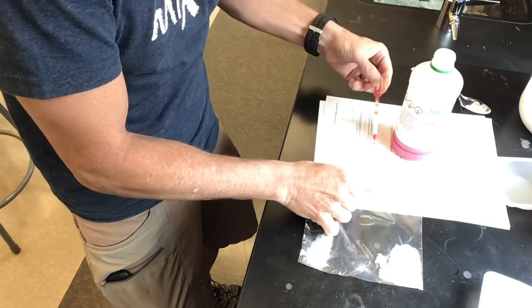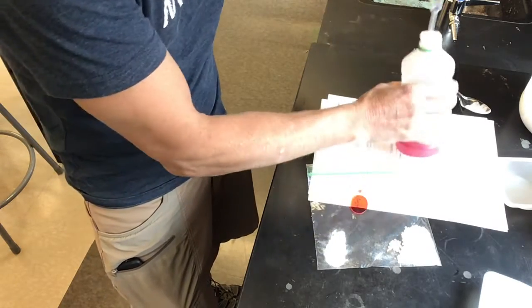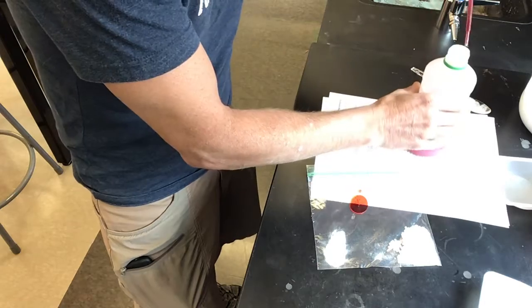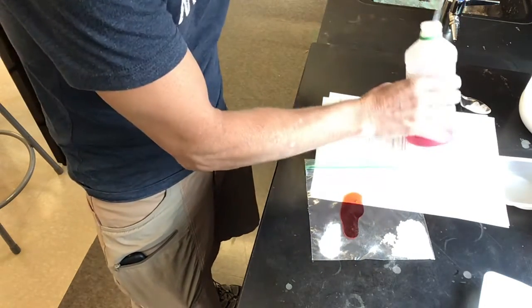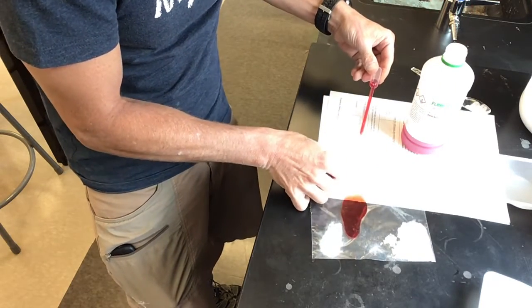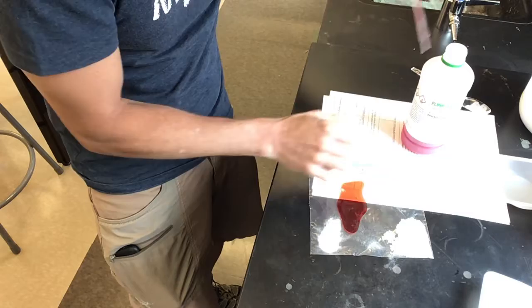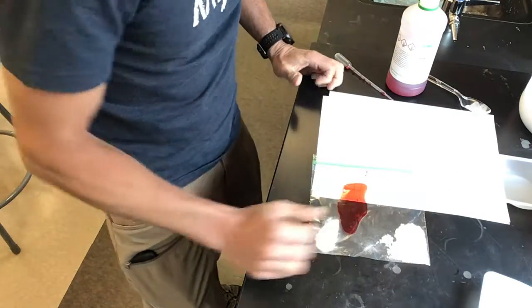So there's 1, 2, 3, and 20 mils of water.